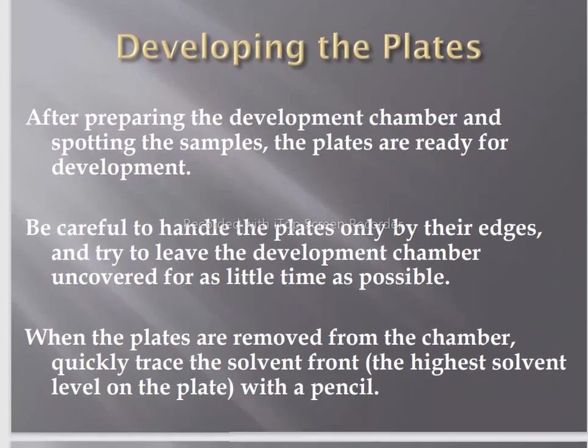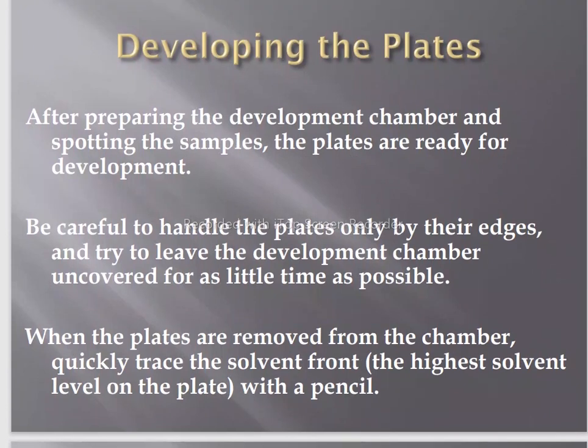Developing the plate. How do we develop the plate? After preparing the development chamber and spotting the sample, the plates are ready for development. Be careful to handle the plates only by their edges and try to leave the development chamber uncovered for as little time as possible. When the plates are removed from the chamber, quickly trace the solvent front, the highest solvent level on the plate, with a pencil.